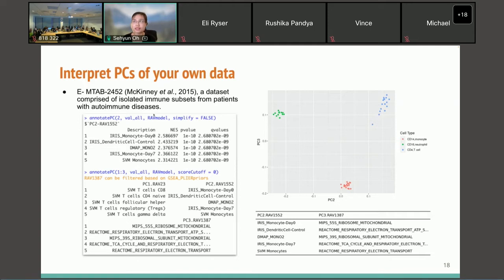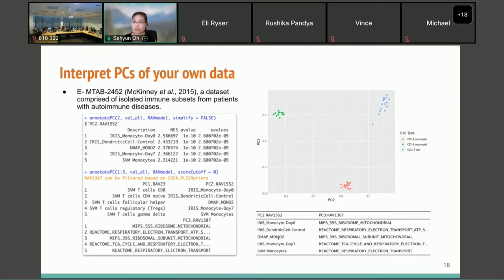We currently require at least eight samples for the validation process. The annotatePC function identifies the RAV most closely linked to the top eight PCs. For example, PC1 is linked to RAV 23, PC2 to RAV 1552, PC3 to RAV 1387, and the enriched pathways linked to those RAVs are extracted. You can draw a PCA plot along with the enriched pathways in a table. I will show how to reproduce this figure in the live demo as well.